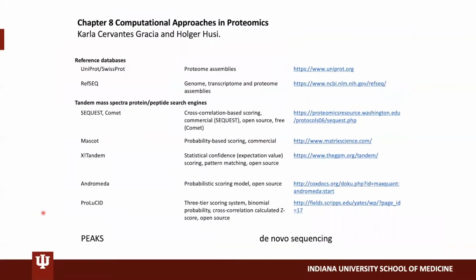And so there are a lot of different computational approaches that can be used. And so SEQUEST, as I talked about actually in the FASTA database presentation, is the first algorithm that was developed for protein database searching for FASTA databases. And so it takes advantage of proteome FASTA databases that we can generate from NCBI or from Uniprot, and then the proteomics core we use mostly Uniprot databases at this point for reasons that I covered in the FASTA presentation.